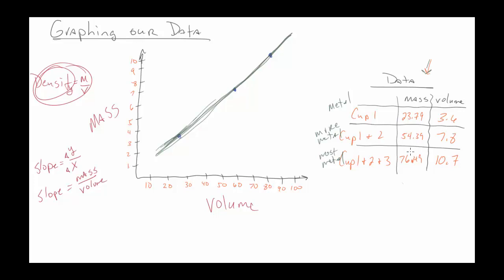And that's true. But I want you to understand what we're doing here is teaching you how to do this kind of data analysis, because what if you had 1,000 points or 500,000 points? You don't want to calculate the average of 500,000 data points, right? You could run the trend line and regression system in a graphing calculator, and it could pick up your trend line and come up with the slope of your line automatically.